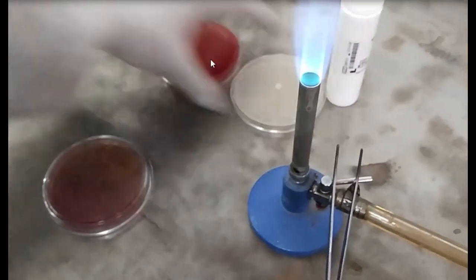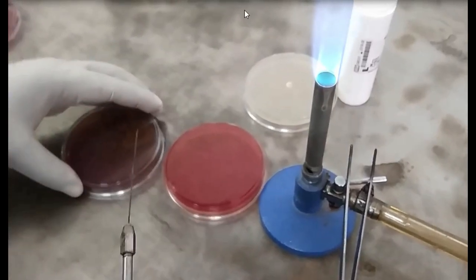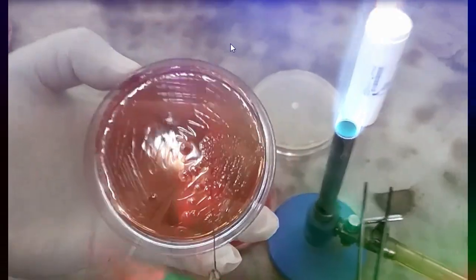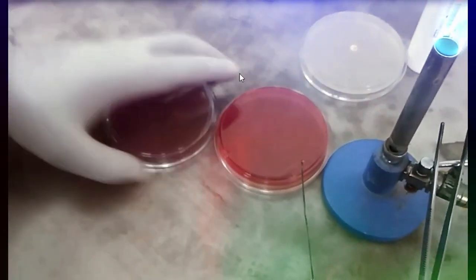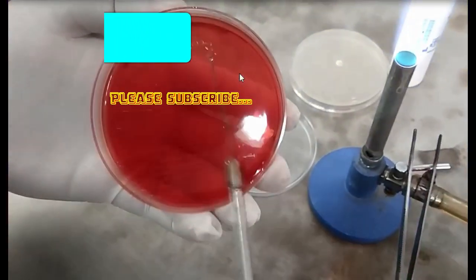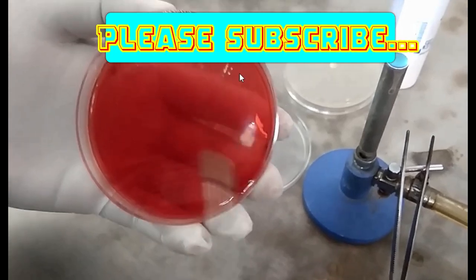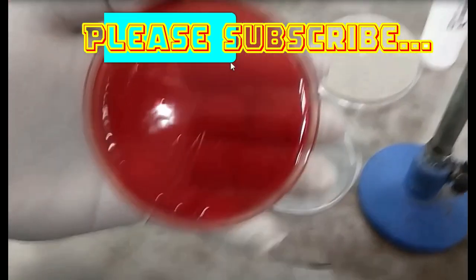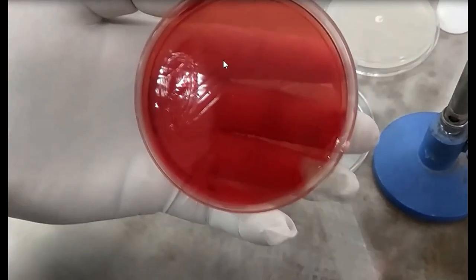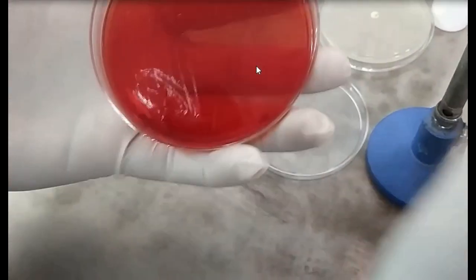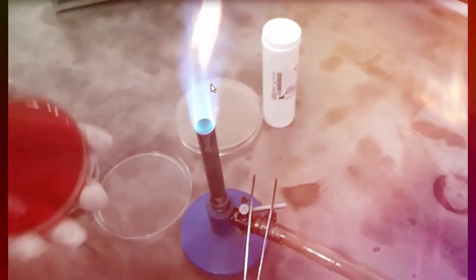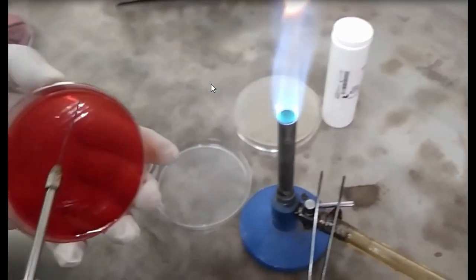If you are inoculating the specimen or making serial dilutions or streaking, these types of activities, sterilizing the loop is done by this Bunsen burner.